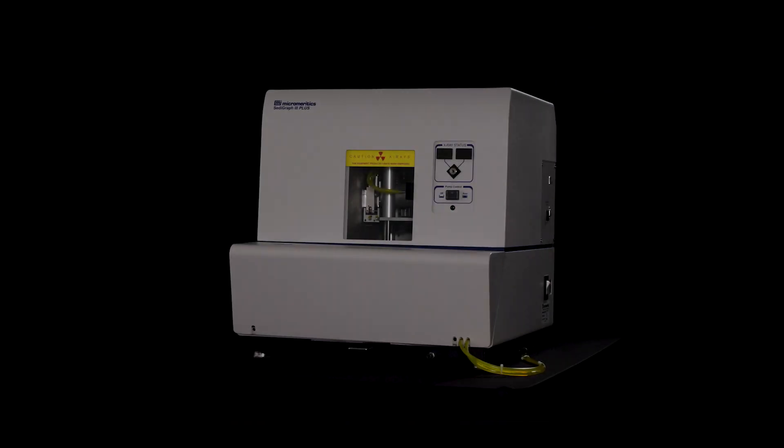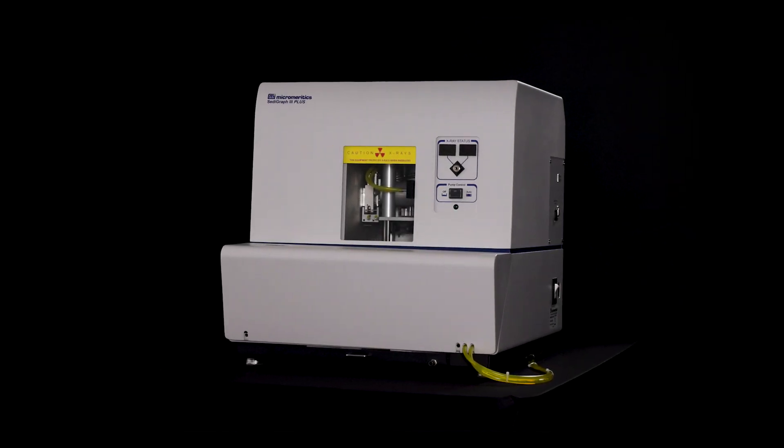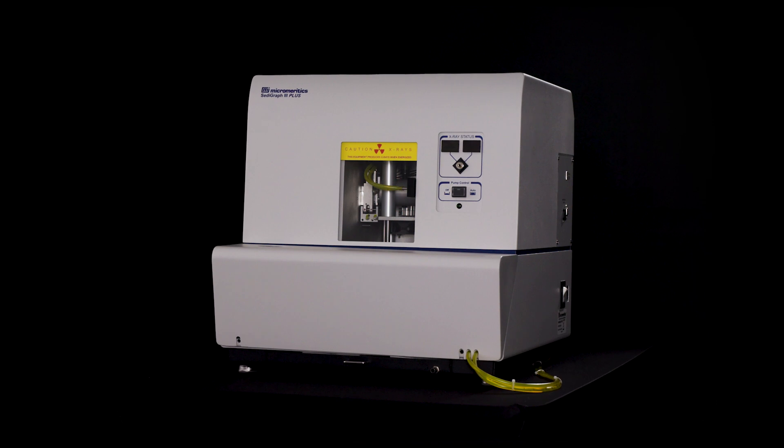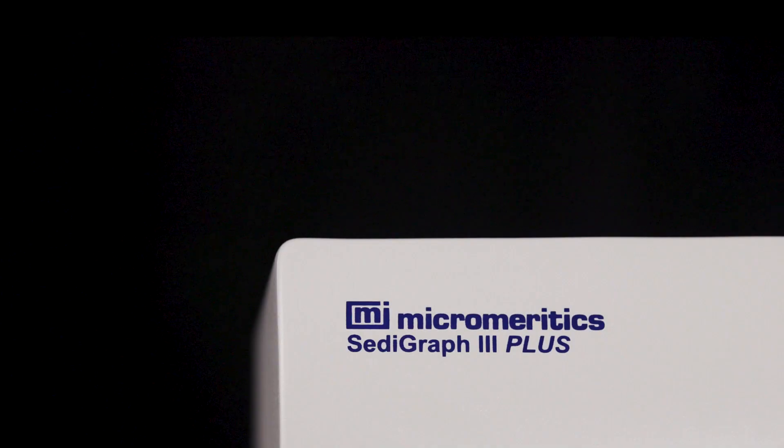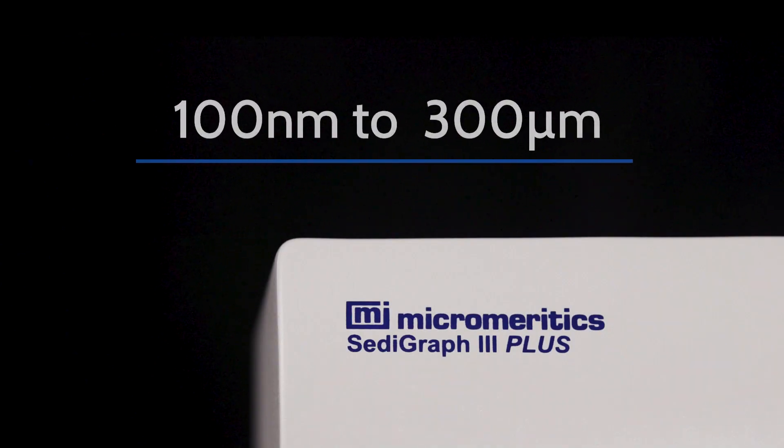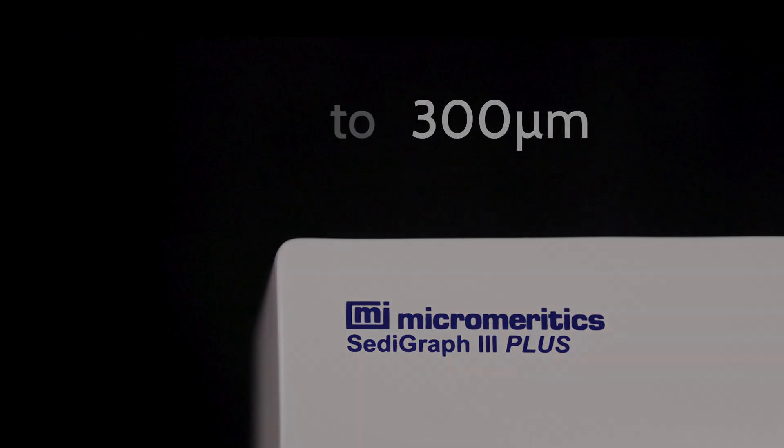The Micromeritics Setagraph 3 Plus is a high resolution particle size analyzer for mining and minerals capable of measuring particles from 100 nanometers to 300 microns.